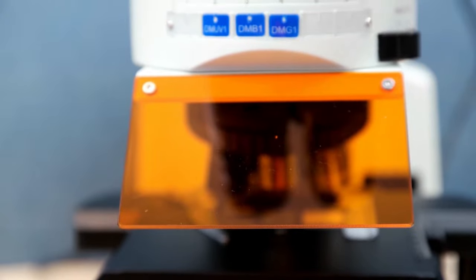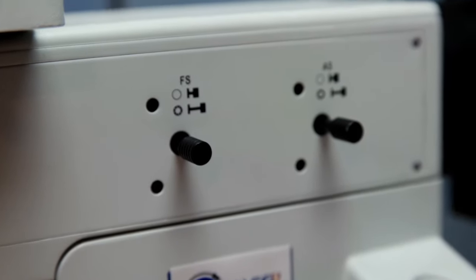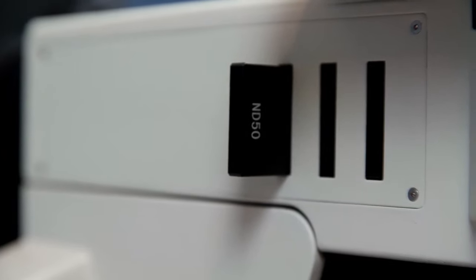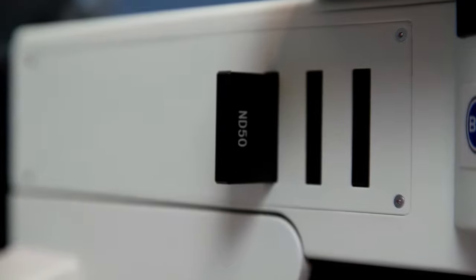It has a UV protection board, shutter, aperture diaphragm and field diaphragm, neutral density filter, and also an extra spot to install a second filter. The attachment has two spots to install a polarizer and analyzer if needed.